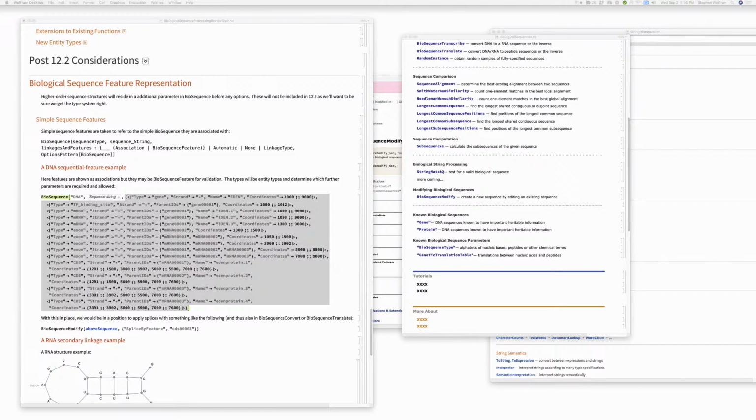So this is an exon. What is CDS? That's the coding regions. So these are the things that, once you finally get down to the base level, these are the regions that are grabbed to make the protein. And what's the difference between the introns?